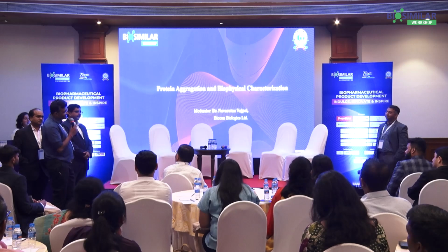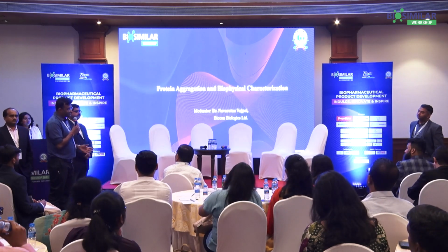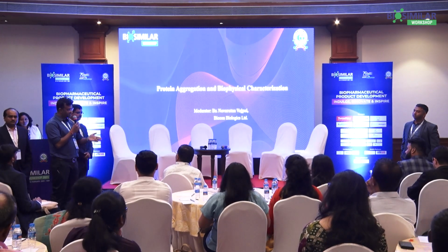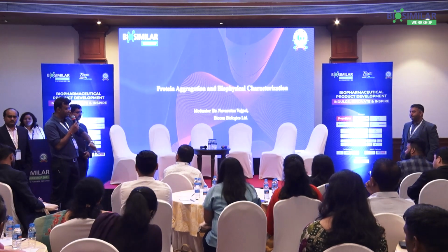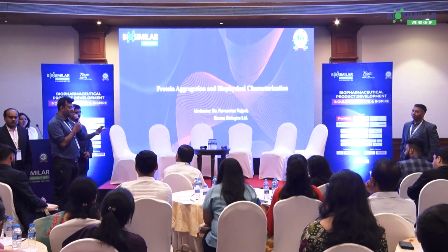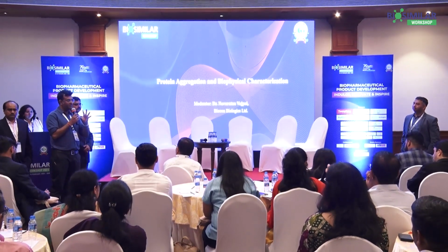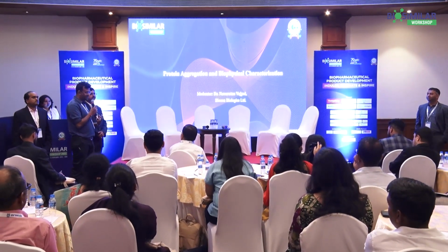Yes, as I projected, there are some limitations on the concentration to which you can go. Within the ambit of that limitation, you can do a linearity set to prove that there is a saturation level. Like we saw from 0.1 mg per ml till 0.2 mg per ml, we used different concentrations to show that the sensitivity or the linearity was maintained. So you can use that. But if you are trying to evaluate 10 mg per ml neat versus 0.1 mg per ml, as of today, the CD does not have the capability to do that.